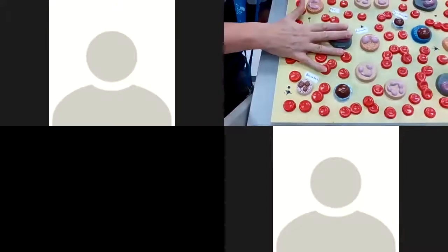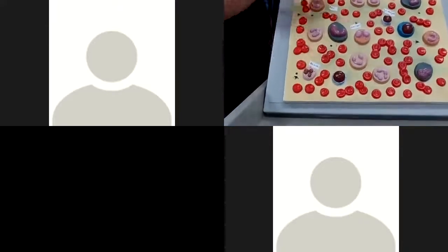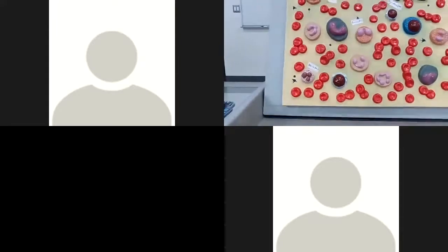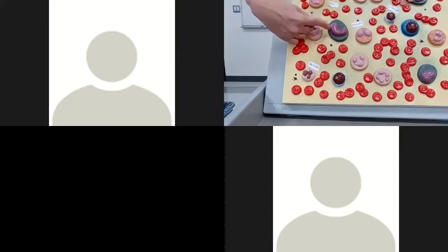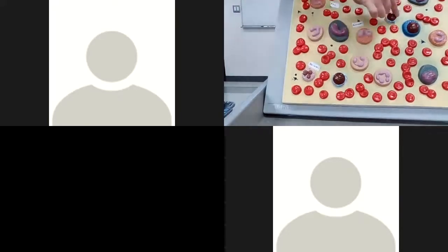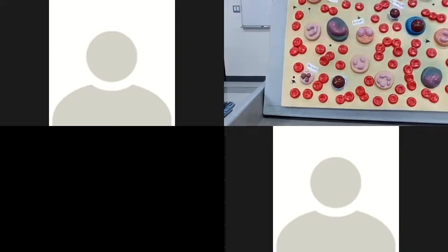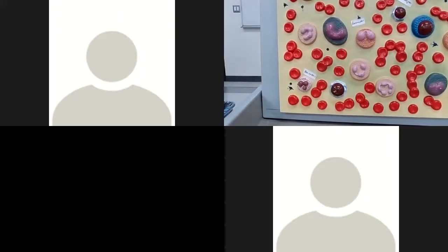So again, by picture, and I did that yesterday in lecture, real quick, by picture, by model, you would be able to identify your white blood cells, or by the information I give you. This guy is the most numerous. This guy is the biggest. These guys spit first and swallow second. This guy swallows first and breaks down second. These guys are part of specific defenses typically. Can't tell them apart unless I do more invasive molecular tests.